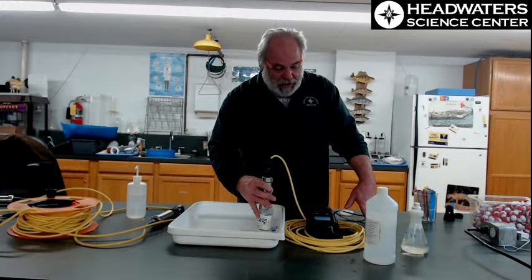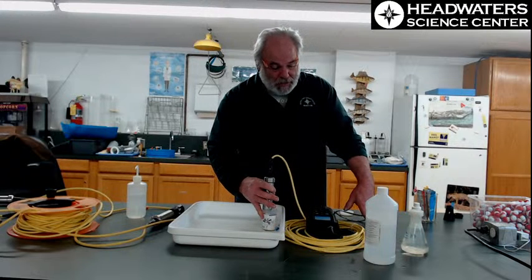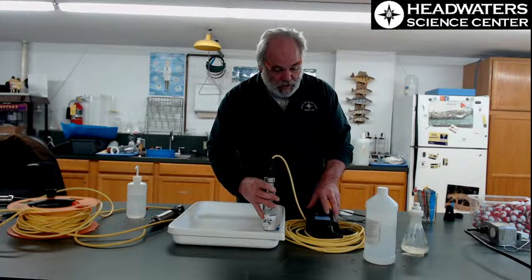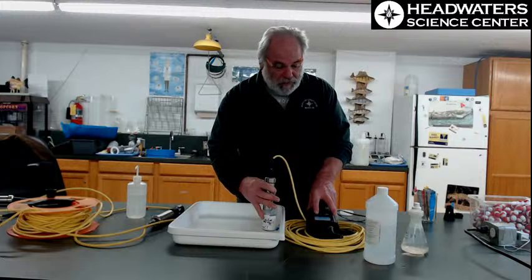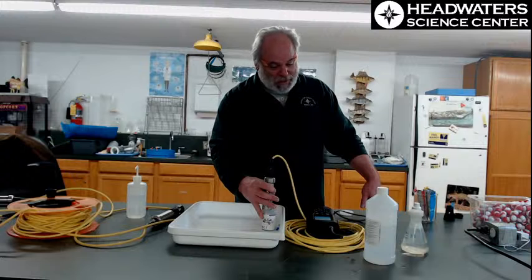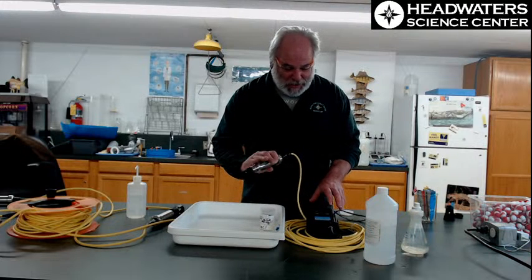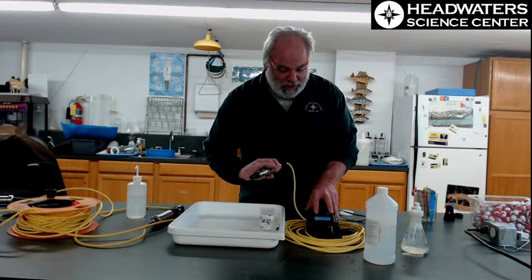We'll get that calibrated, and the meter does some hocus pocus, some mathematical curve smoothing, and we're done. We'll store it, and I like to be patted on the back to make sure I did all my calibrations right. So I always do one more reading, and my reading comes back at 1,000, oscillating between 999 and 1,000. What that's telling me is that the meter wants to drift the other direction, but that's fine with me. I can live with all of that.